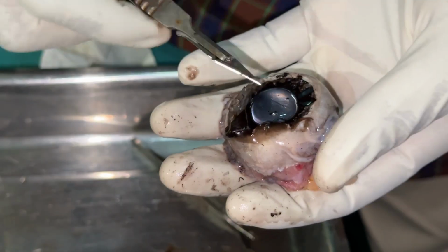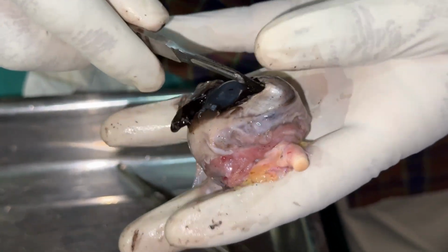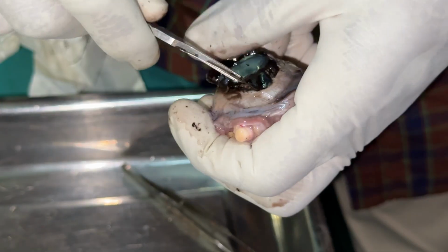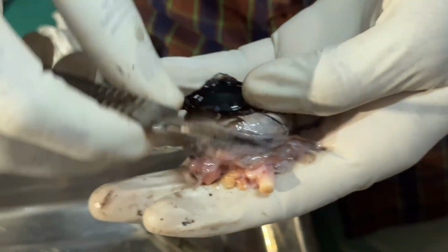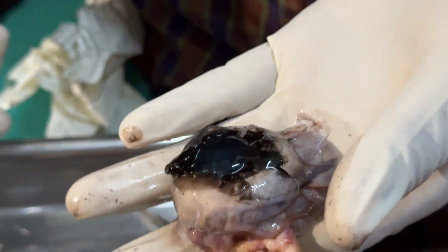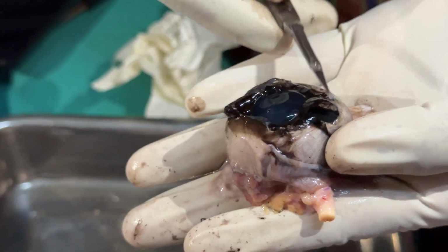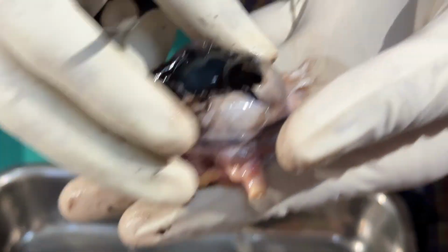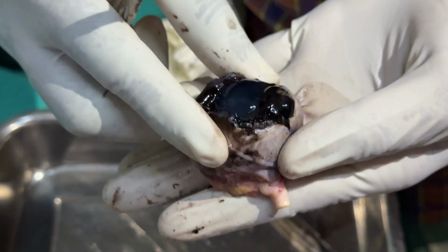One area of the sclera we will cut. Then only we will get the choroid structure. When we give an injury to the sclera, the vitreous humor bulges out. You see the vitreous is coming. This is the vitreous. It's an acellular structure, just like a semi-solid structure.